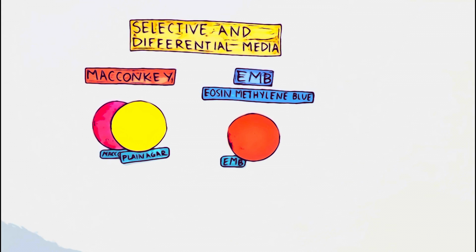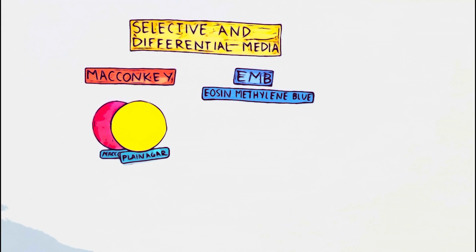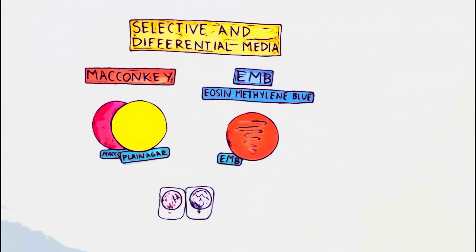MacConkey stays pink for lactose fermenting colonies and turns yellow for non-fermenting colonies. On EMB, colonies will turn metallic green for lactose fermenting bacteria. For non-lactose fermenting bacteria, they will just stay normal. This differentiates between lactose fermenting and non-lactose fermenting for both MacConkey and EMB.